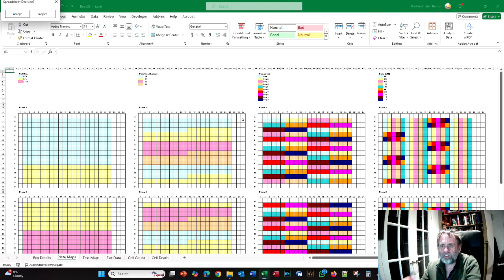You can see how, using the Platemaker wizard and the preview, you can design the plate layout on the fly. By looking at the maps, you can very quickly sort out exactly how to lay out the plate so that it makes sense. So this looks okay, except we have another issue, and that is, if you look at the duration, we now have 24 hours to here, and then suddenly we have it going to 48 hours. Ideally, you would probably want to separate this completely, but also you definitely wouldn't want to change halfway through the plate.